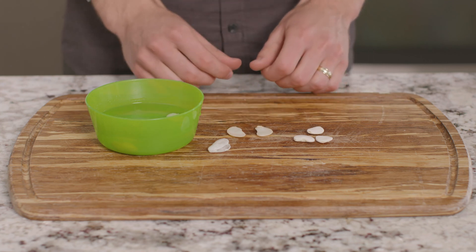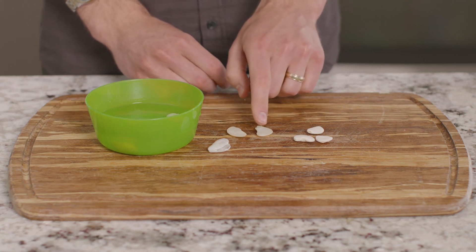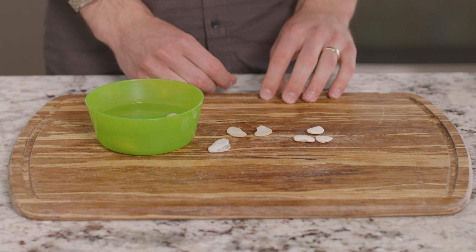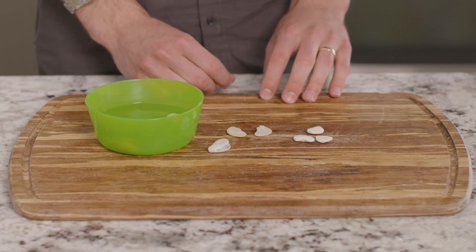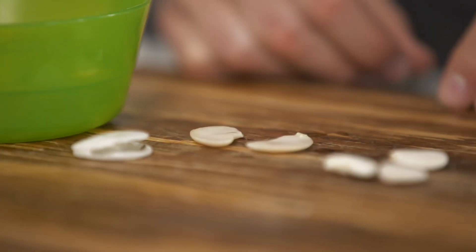What do you see now? Within the seed coats are two cotyledons, one on each side, which store all the nutrients the seed needs to germinate and sprout into a plant. The cotyledons will often become the first leaves to appear from the seed.